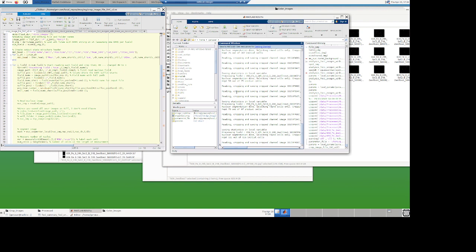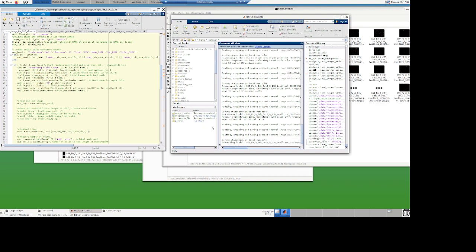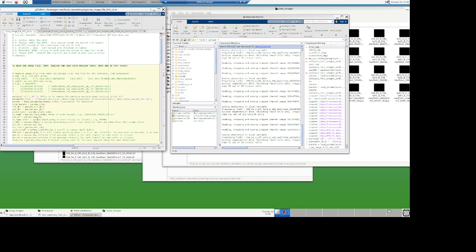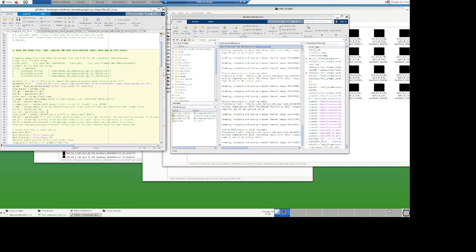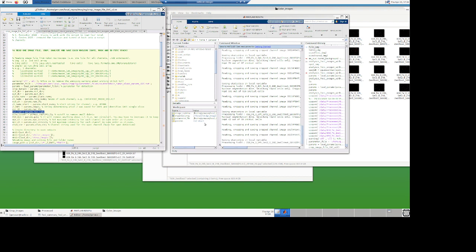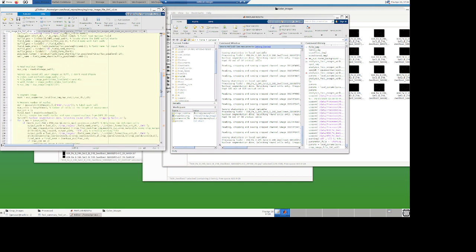Or size, sorry. I have a size filter on this for the nuclei. The filter for size is based on the nuclear radius. Let's see where it's at. Right there. So you have the nuclear radius, which is then I do pi nucrad to the power 2 times 75%. That's my size cutoff. And that basically allows to get rid of small debris that would be picked up as nuclei. So I do a cutoff by the sphericity, P2A, and the cutoff. And that is located somewhere here.